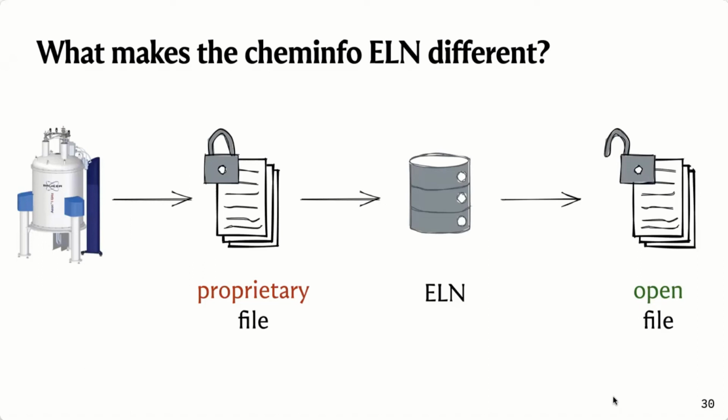And then in our case, how we deploy this thing is that most groups also have a nightly dump of all the data onto some other server as just a zip file. And so they just have like the full file structure with all the reactions and attachments on some server where they can just open the folders for all the students and have all the spectra in there.